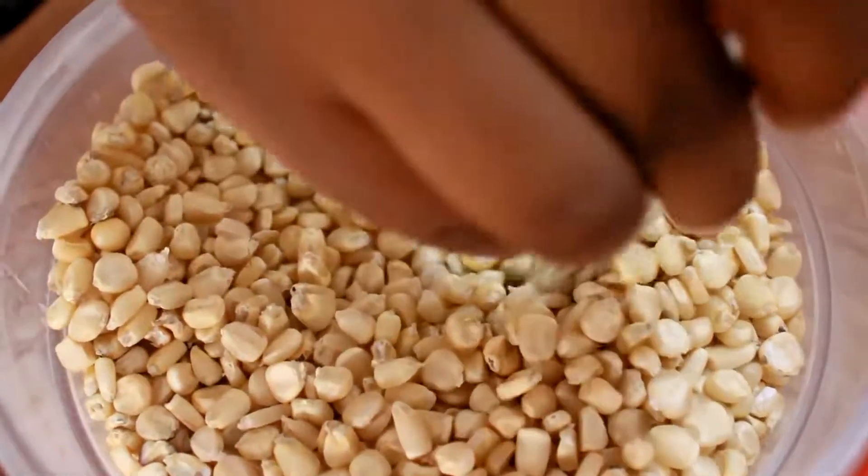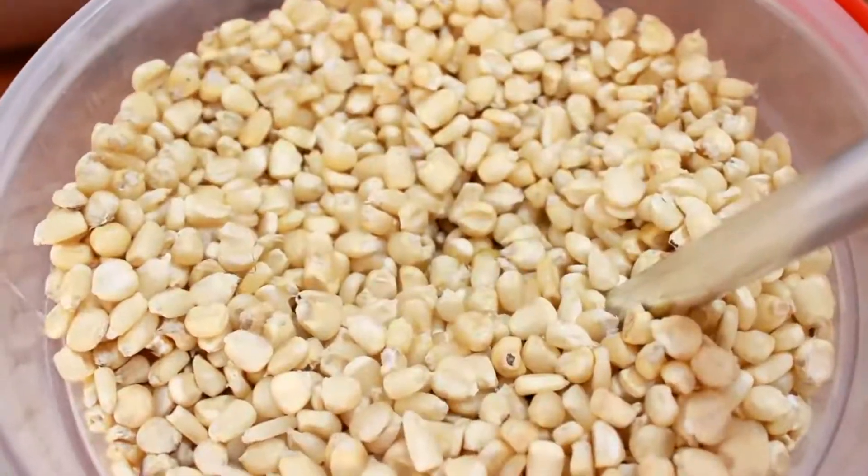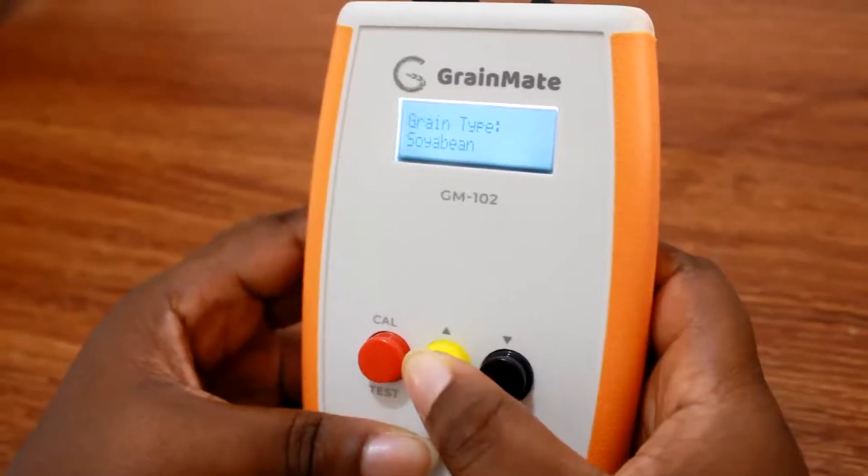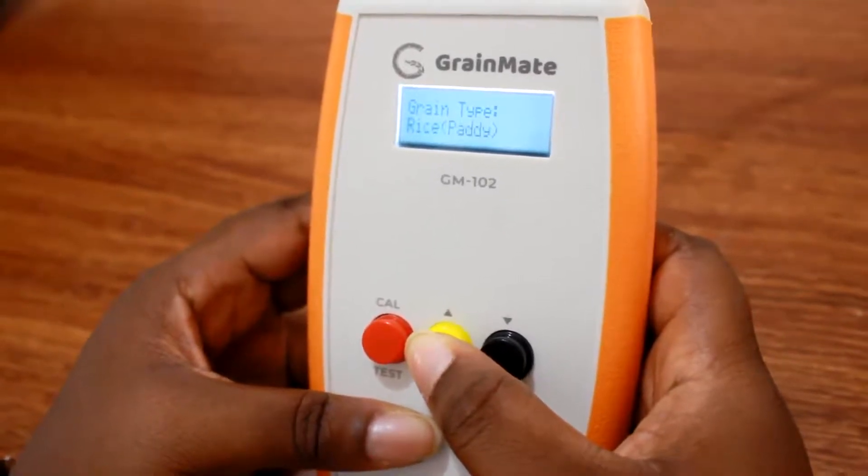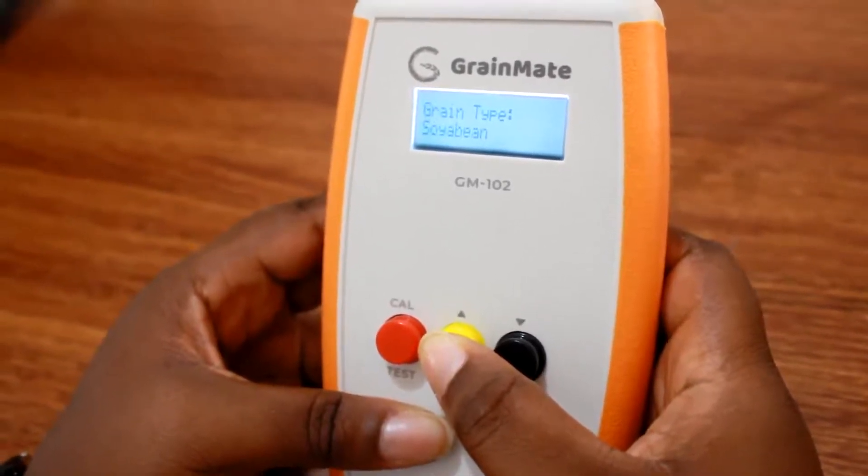Insert the probe into the sample you want to test. Then select the grain you want to test by pressing the select grain button until you get to the grain you want.